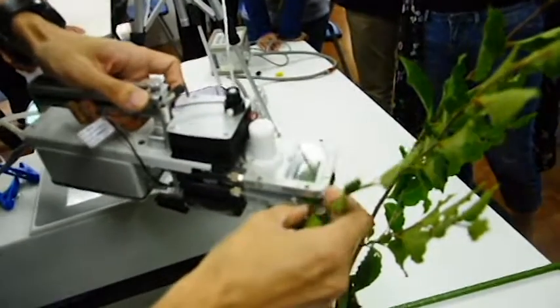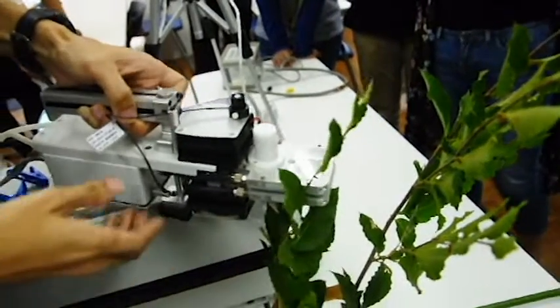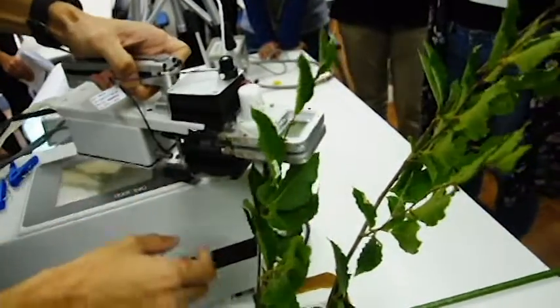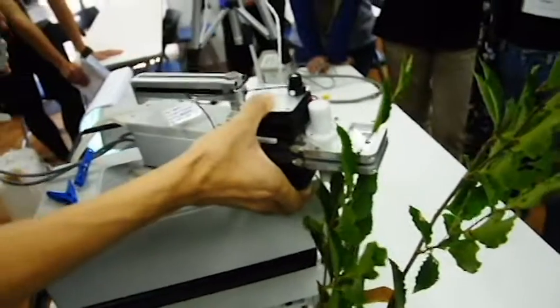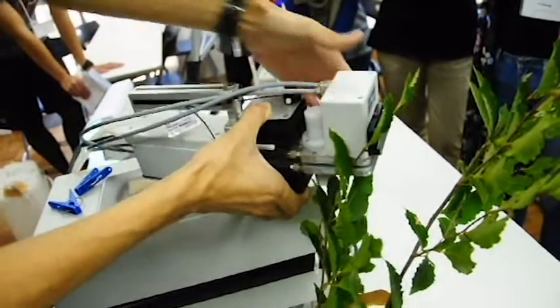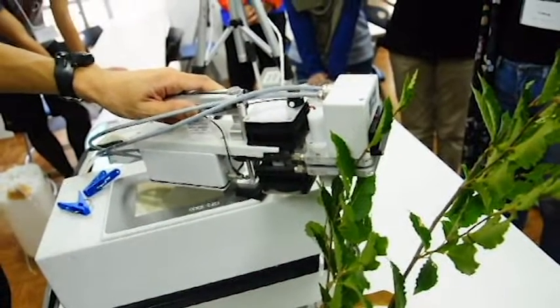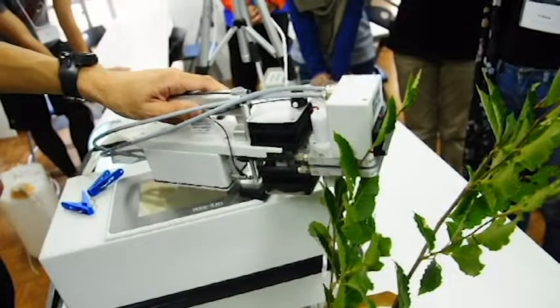Yeah, like this. Okay. And then, set the chlorophyll fluorescence LED head, and then push this.